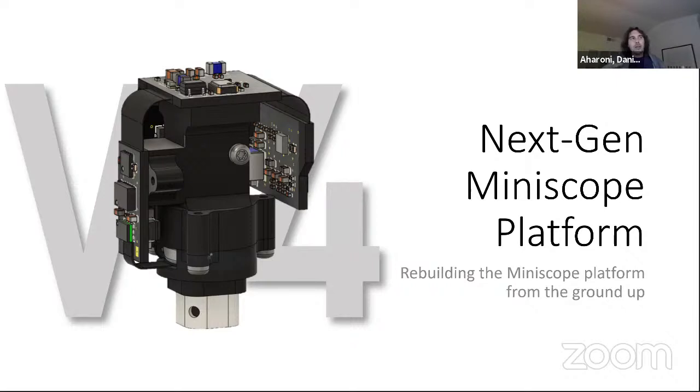But if you were to convert this, sort of like, what is your signal over just the overall background? It ranges from, I would say, under 10% to over 100%. So it depends on the expression, the quality of the surgery, which miniature microscope you're using to image. But it does put a limit, especially because our background or baseline fluorescence is reasonably high. And the sensitivity of these image sensors is lower than what you would have as a photomultiplier tube in a 2P microscope. You generally cannot resolve the fluorescent response from an individual spike. So we're usually seeing trains of spikes that generate a large enough fluorescent response for us to see.